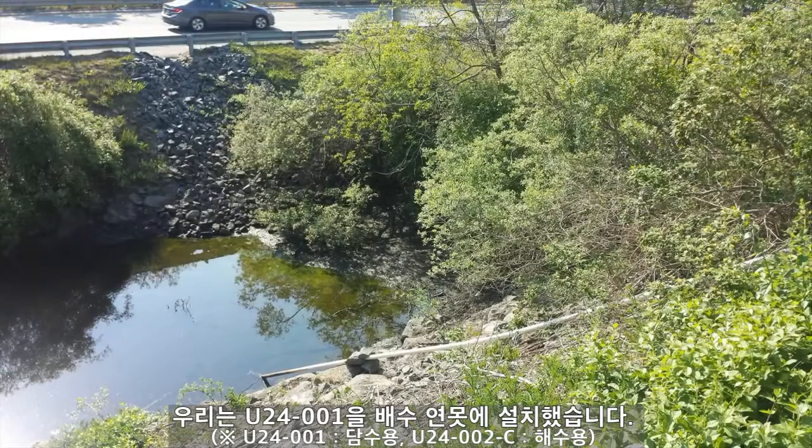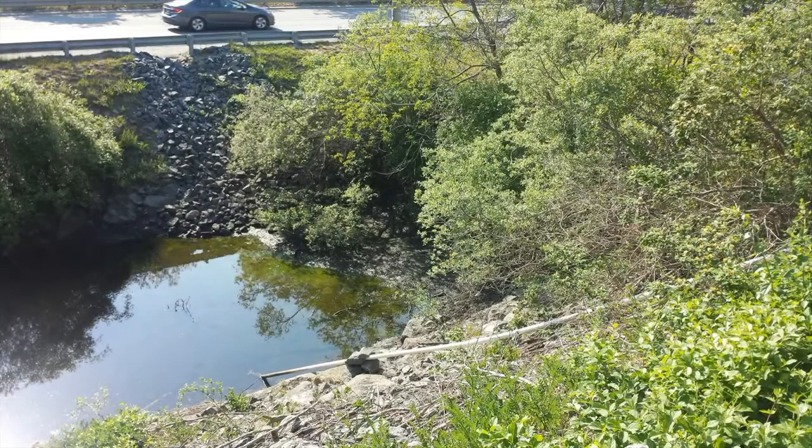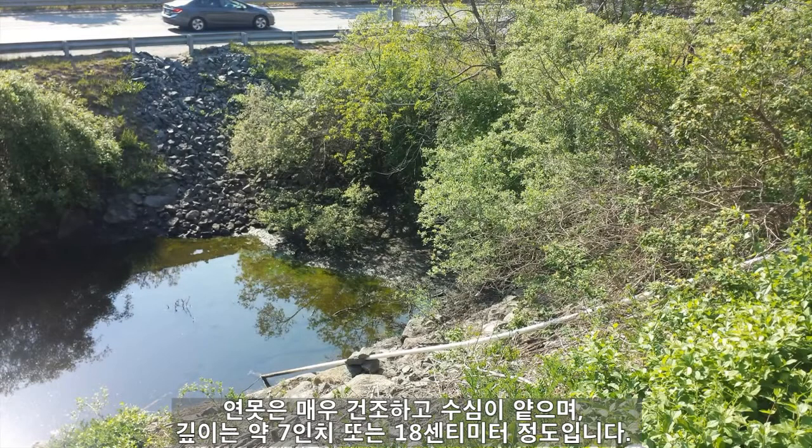We deployed the U24-001 in a drainage pond. Here in this image, you can see it's right next to a very busy road. It gets all the drainage from that road as well as the onset facility parking lot. It's been very dry, so this pond is quite low.